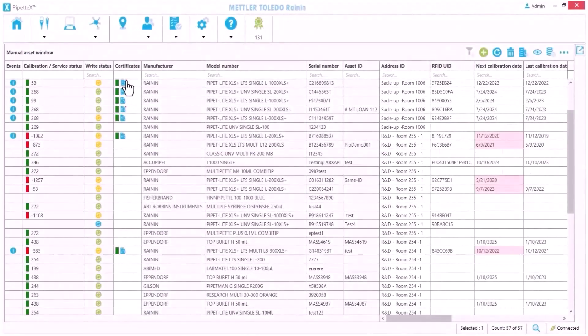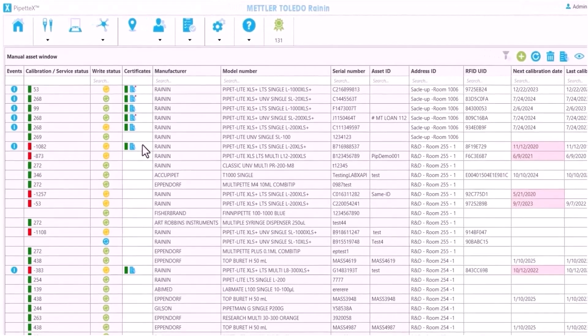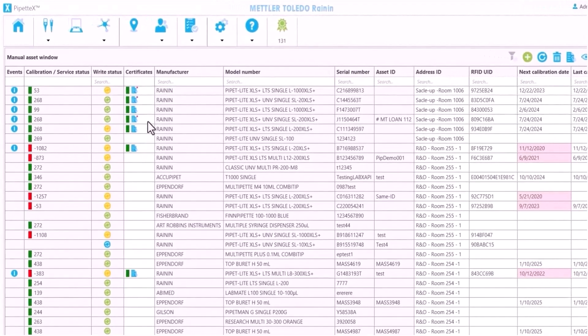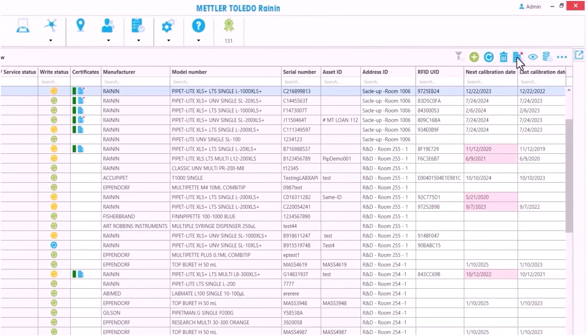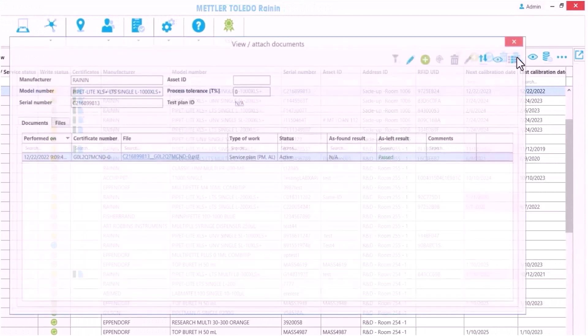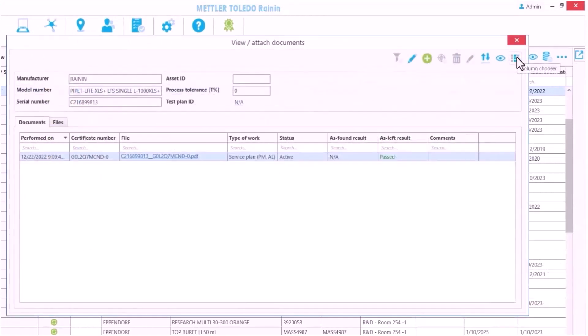Anytime calibration is done by Rainin, a new certificate is added automatically. I select a pipette and click on the certificate icon in the upper right to get the certificate view for this pipette.